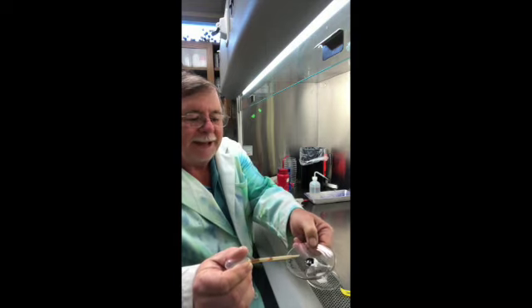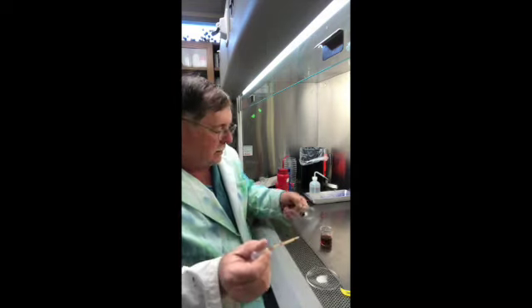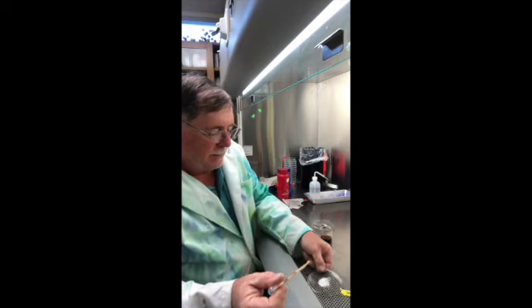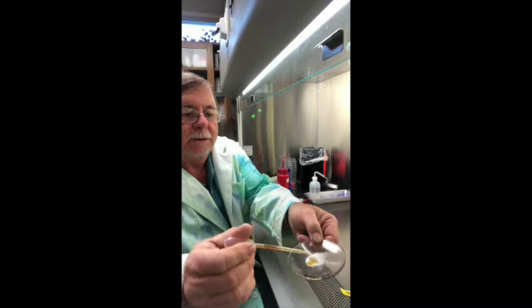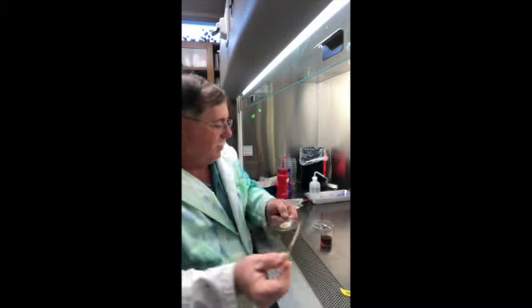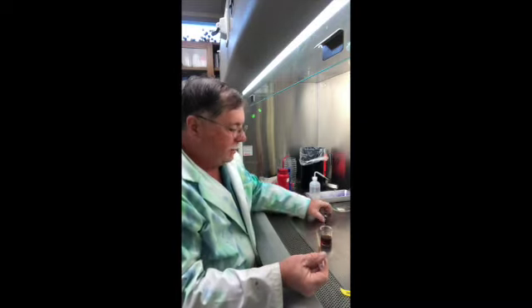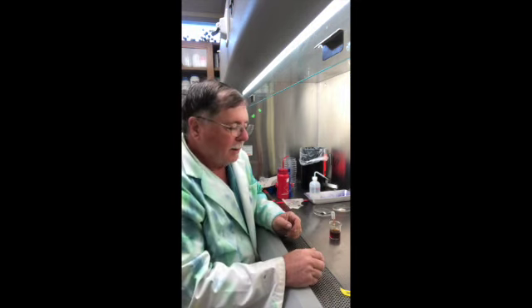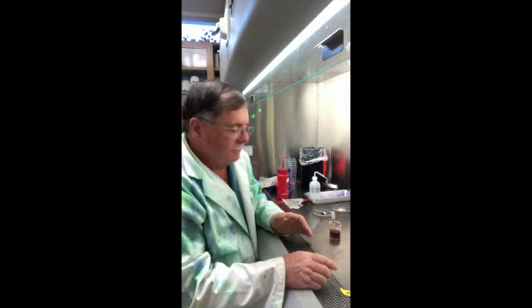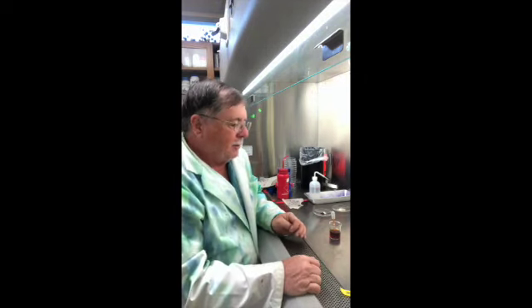Okay, so it turns black. Here is glucose. It doesn't turn black. So if there's starch present, it will turn black. If there's no starch present, it will not turn black. Okay, so I'm going to flood each plate.